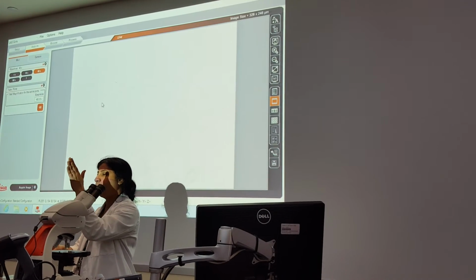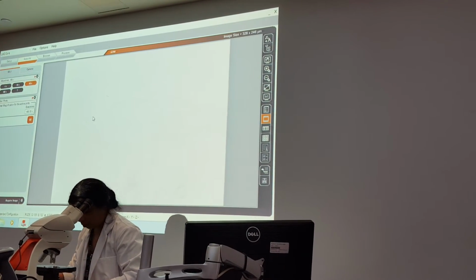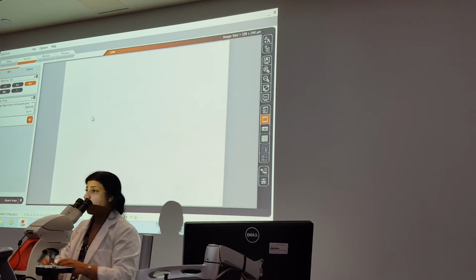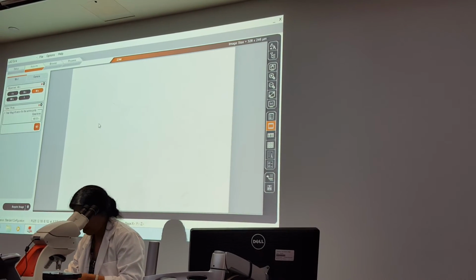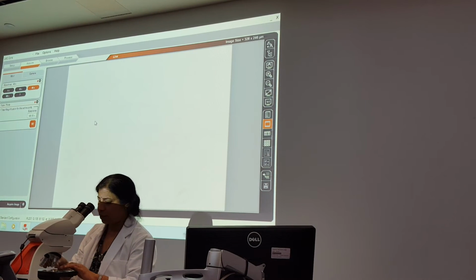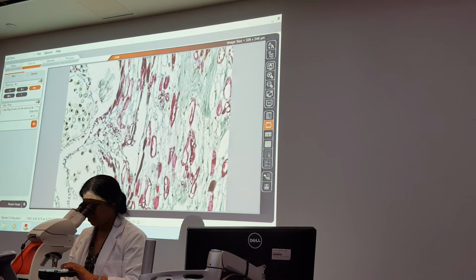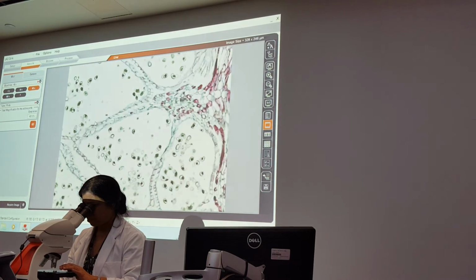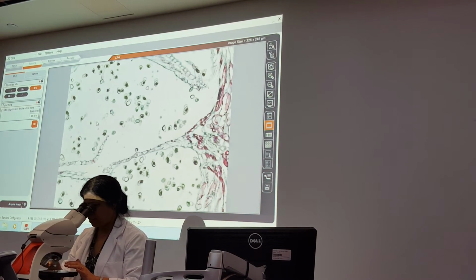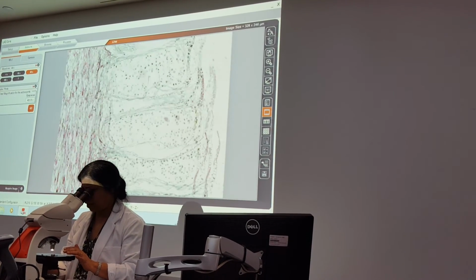Then we moved on to pinus, right? Okay, pinus you did male and female. Let me show you something and you'll tell me what it is. What are you looking at? Male cone, right? Staminate cone.